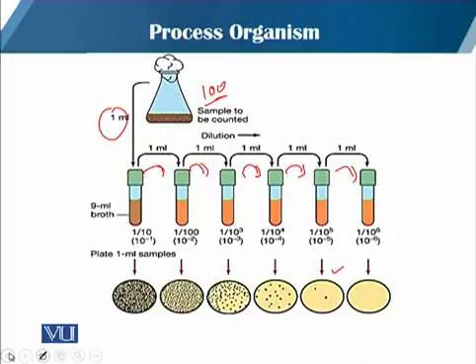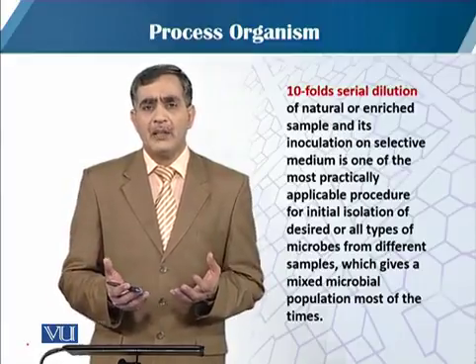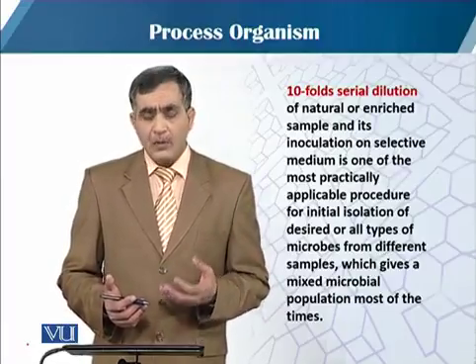Sometimes there is not a sufficient amount of organism in a sample, and then we have to use enrichment cultures. We add extra nutrient into the sample to multiply the organisms in the same environment, and then we do the isolation by dilution.